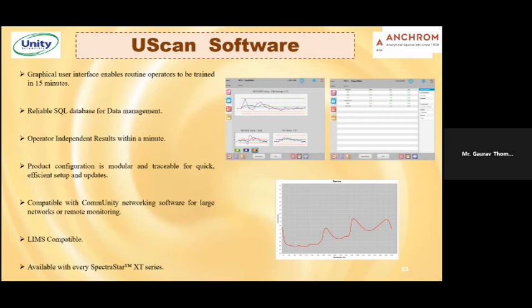Now, this LIMS compatibility. LIMS stands for Laboratory Information Management System. Any sample that is analyzed by the analyzers or the monitors, and different departments have different parameters to look for, right?